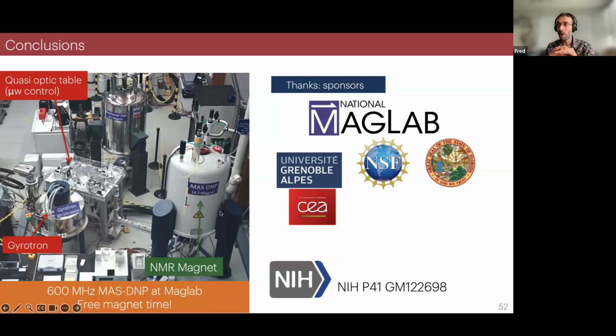There's also an obvious case, which is radical aggregation. So you don't see any features anymore. You just see a blob and everything has collapsed into a single line. Then you know something is really wrong here.